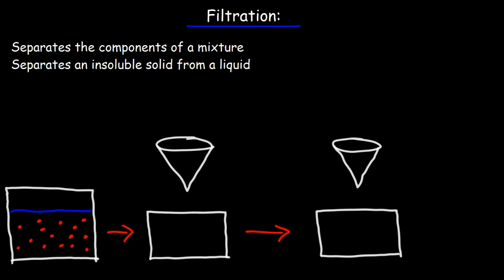In this video, we're going to go over some lab techniques that you might be tested on if you're studying for the GCSE chemistry exam. So the first one we're going to talk about is filtration. So what exactly is filtration? What is it used for?